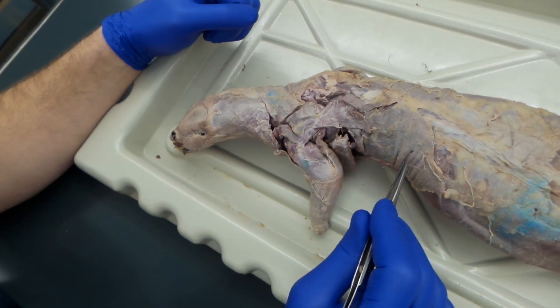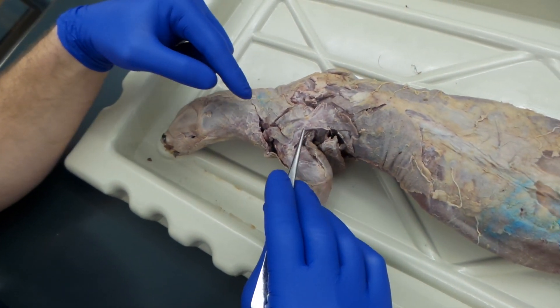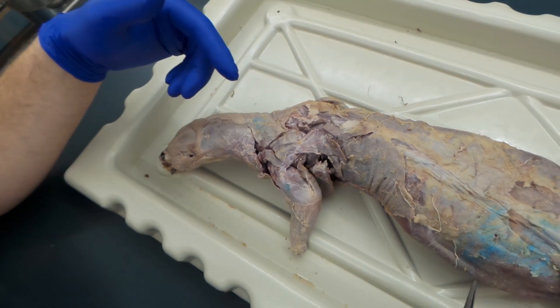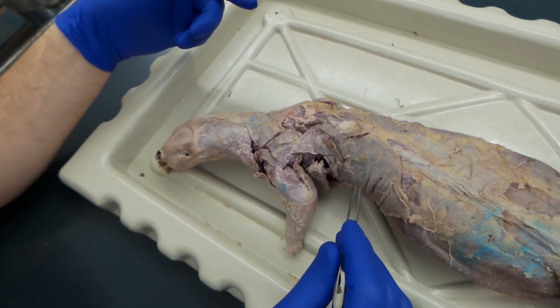This is the dissection for week three. We're going to quickly review the muscles from last week, and then we're going to look at deep muscles of the back, the abdomen, and the pectoral muscles.